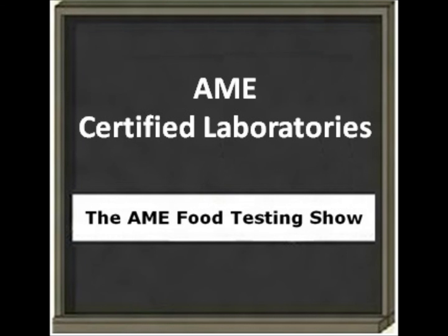One is you need a large amount of research to sequence new pathogens and define the variability in the pathogens across the globe, because we're living in a global community now. A contamination in one place in Australia could end up in some other plant here in the U.S. So the global knowledge database of pathogen sequences is important, and then use that to develop highly sensitive assays of detection. So that's all I have to say.